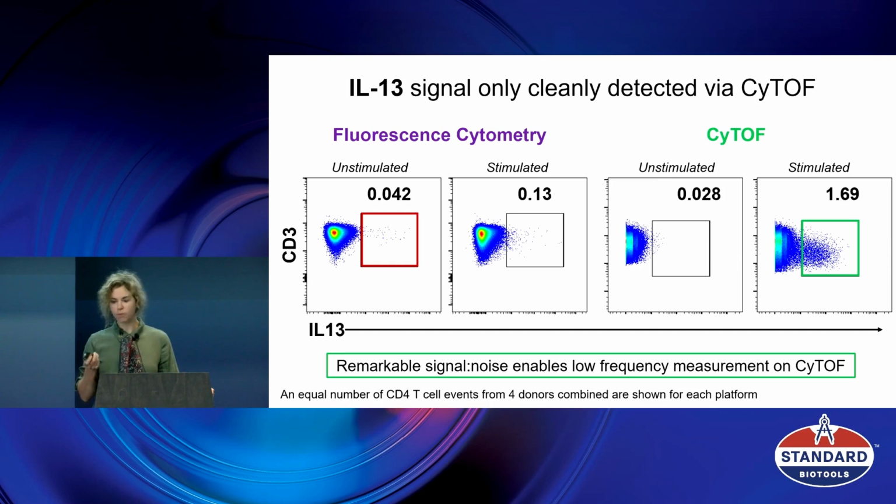With CyTOF, we know that there are buckets of IL-13 in the supernatant, and we can detect the cells easily, again and again and again. We've seen it so many times now, and it doesn't fail to impress me every time I see this.